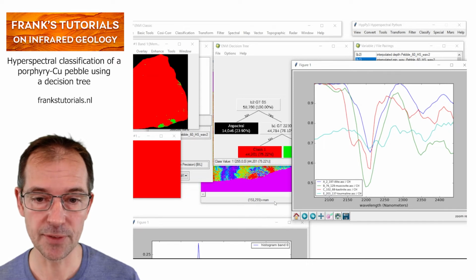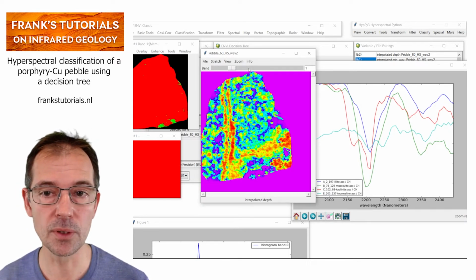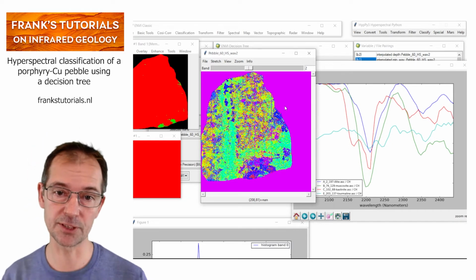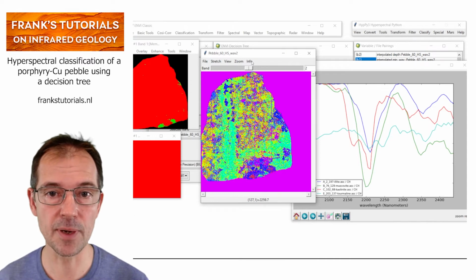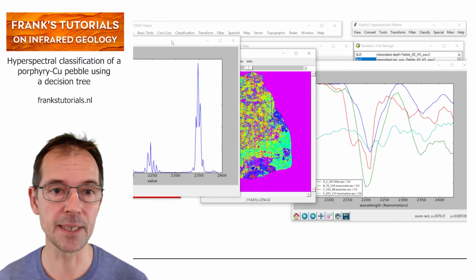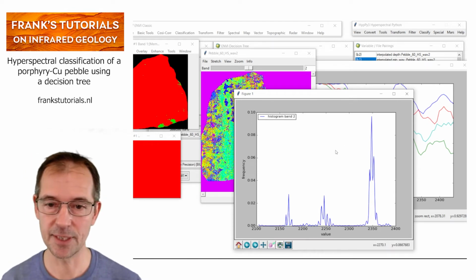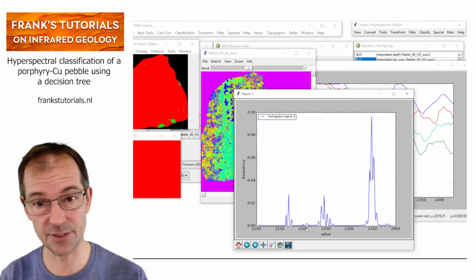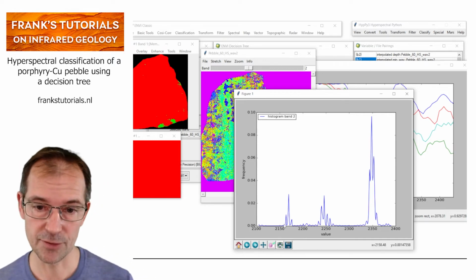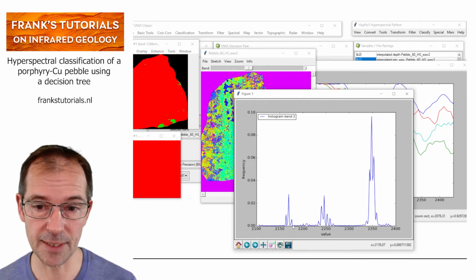We can also illustrate that here. So I can show the wavelength position of the second deepest feature. And if I make a histogram of that one, then we get this. What we see now is completely different. There are not many pixels at 2200 that have the second deepest feature, but there's a group here which is a shorter wavelength, the wavelength of kaolinite.